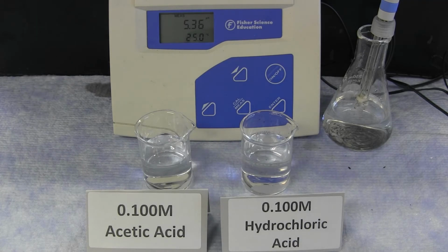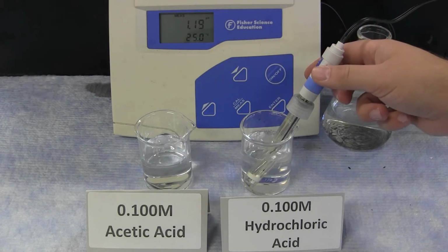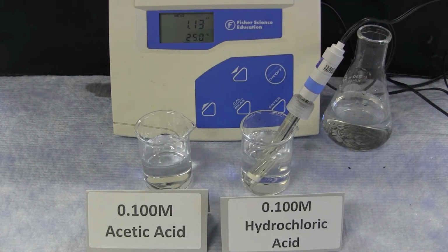The differences between a strong and a weak acid can be seen through the percent ionization of hydrochloric acid and acetic acid. Both the hydrochloric acid and the acetic acid are at concentrations of exactly 0.100 molar.